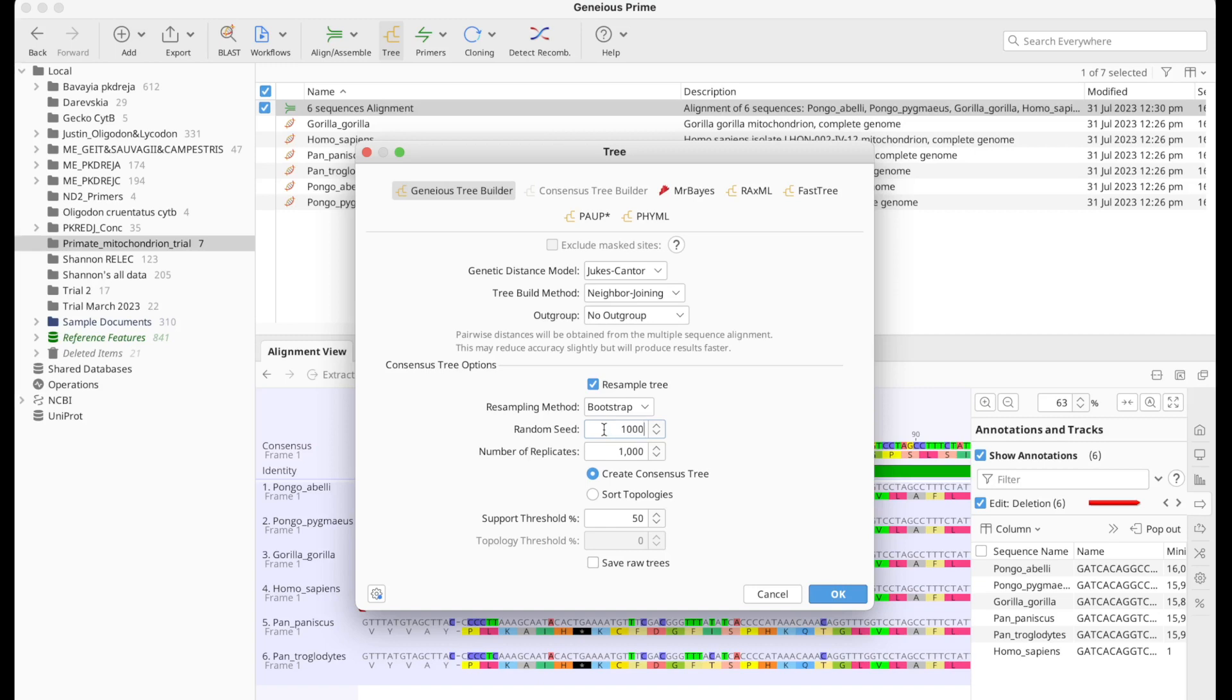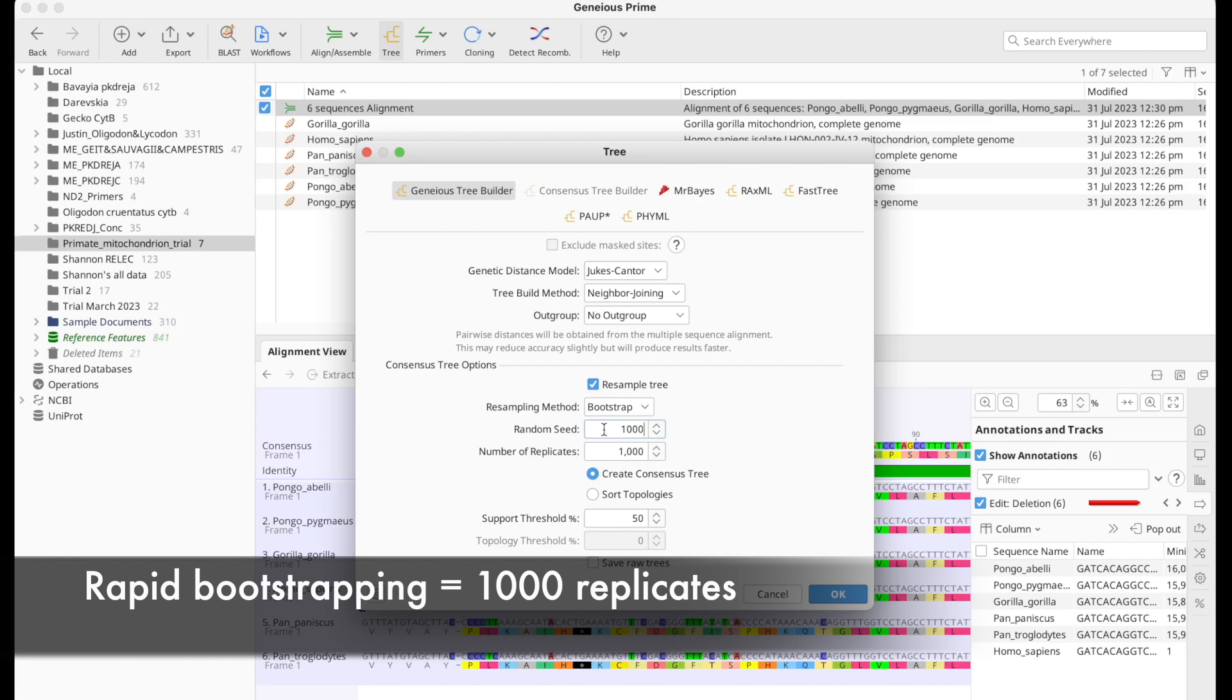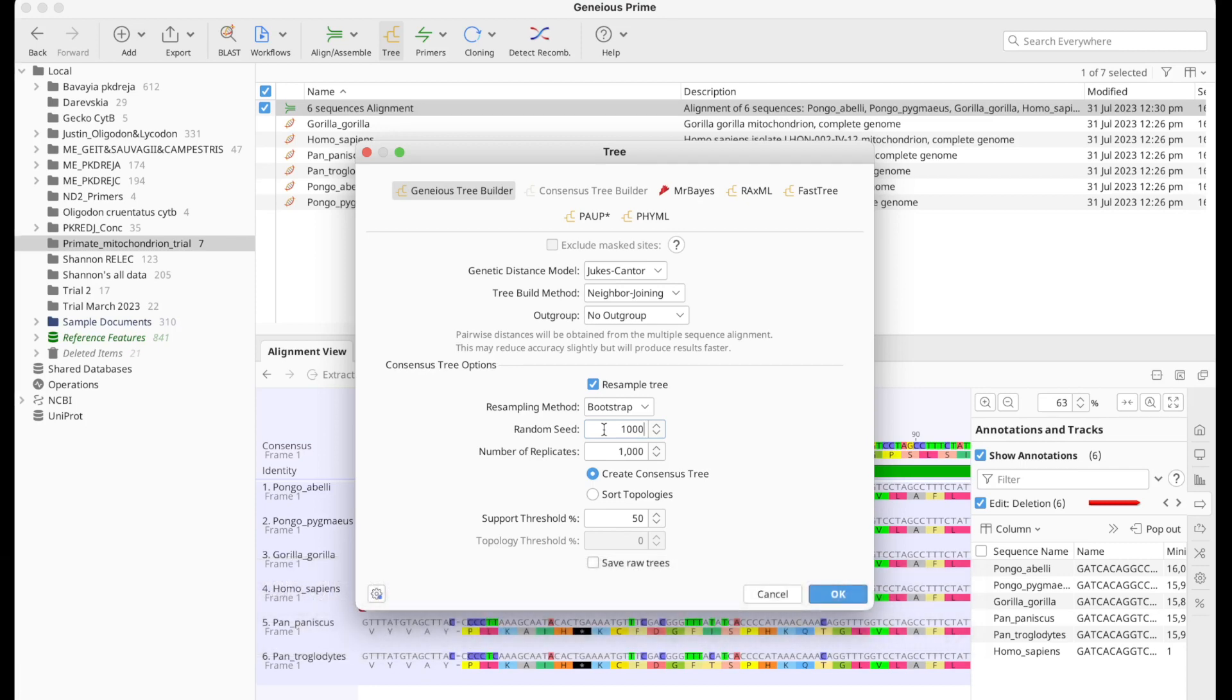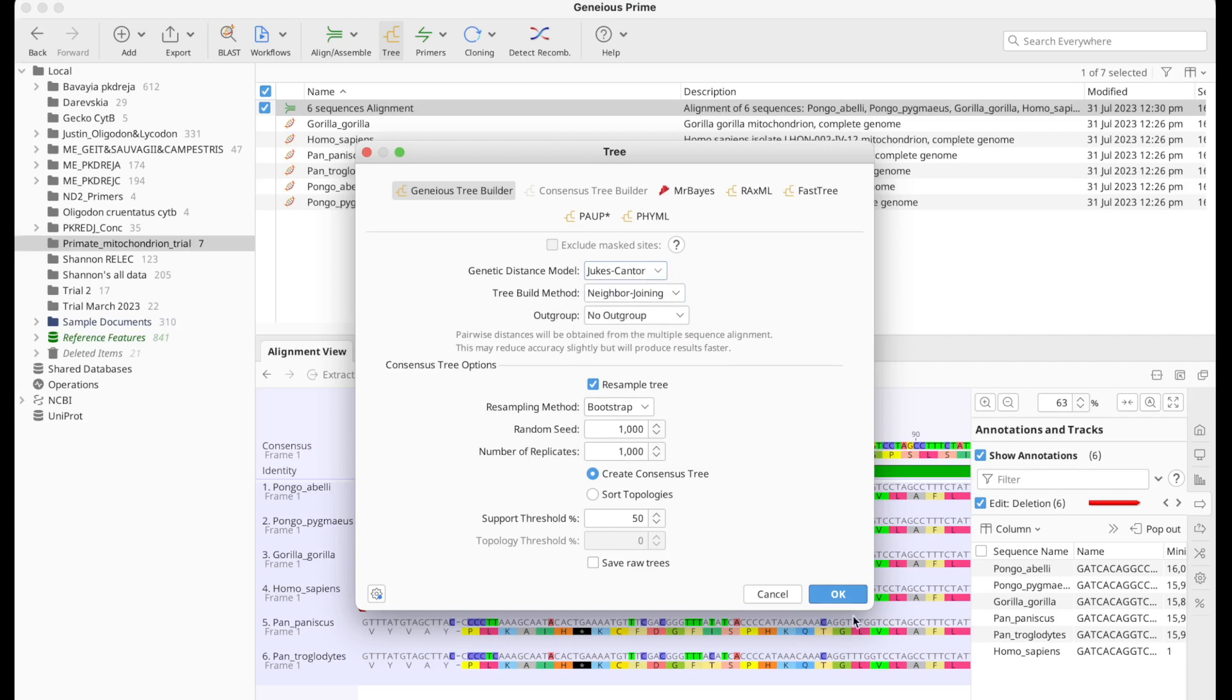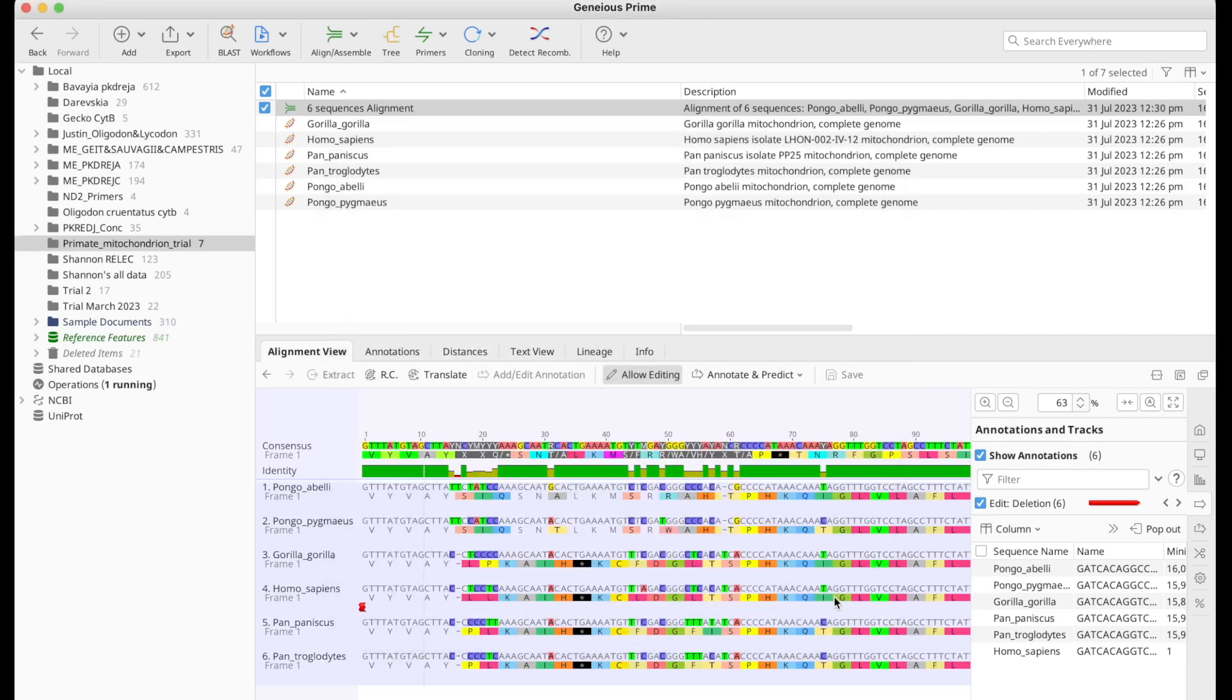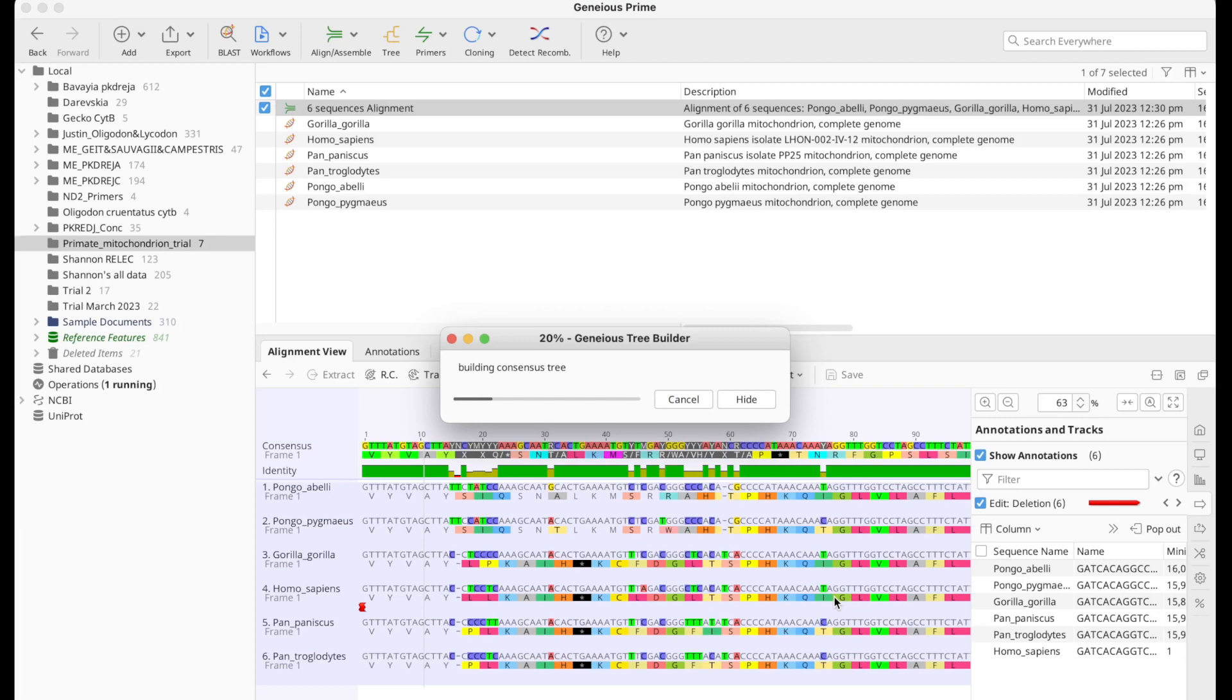So let's start with the Genius Tree Builder. I'm just going to go ahead and do 1000 replicates for bootstrapping. So it's a rapid bootstrap. We don't have any outgroups. I would like to use neighbor joining and Jukes Cantor genetic distance model is fine. Let's go ahead and click OK.